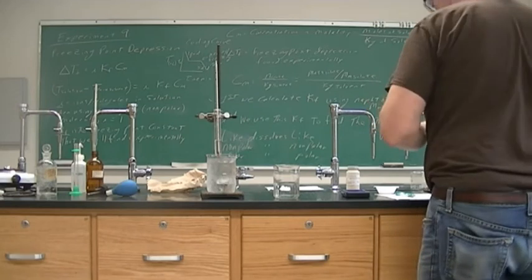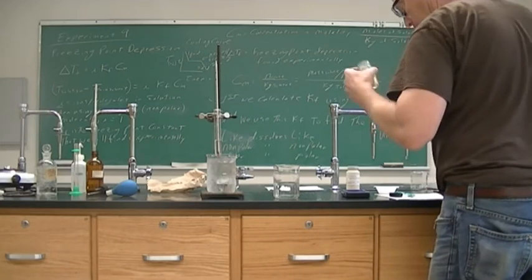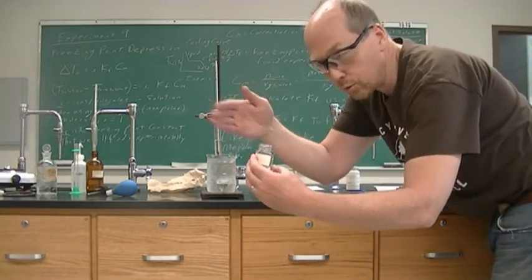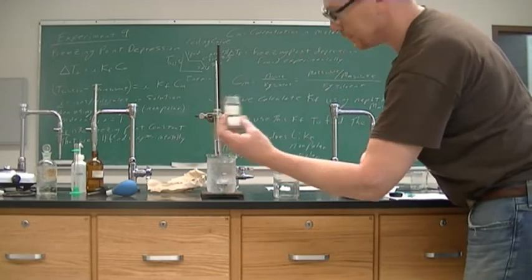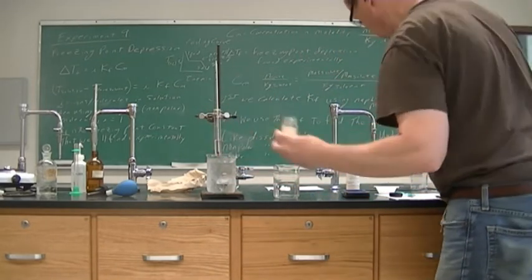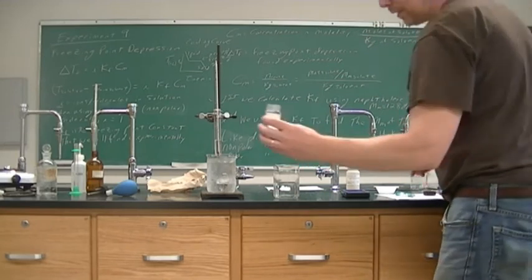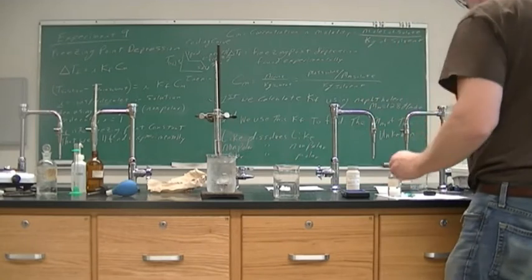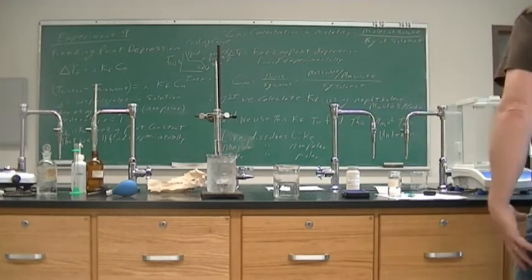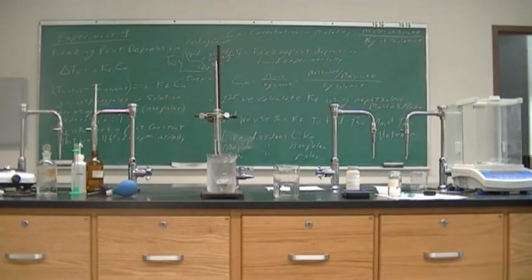So now we want to weigh our unknown. All right, and if you smell the unknown, I'll give you a hint. It smells like a men's restroom. So it is something that would be in a men's restroom, not any other type of restroom. Usually you don't have this smell. Men's restrooms, you have the smell.